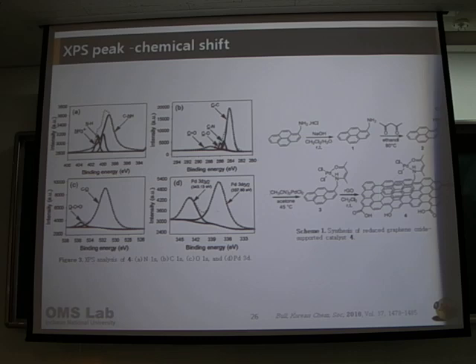It makes sense that you have a coordination between this functional group and this palladium, but it is still very difficult for me to understand from this whether you have a complete coordination or the coordination ratio. But I don't think it will be very difficult. I took the SEM and the EDS mapping. With the EDS mapping, we can know the element arrangement and element percentage, and I also... No, I think that will be very difficult.